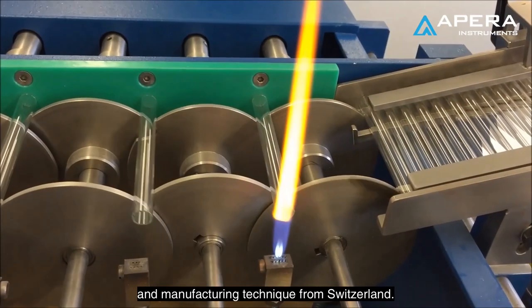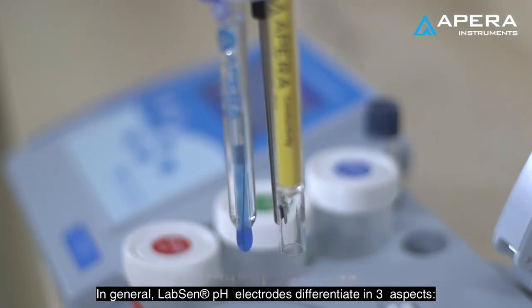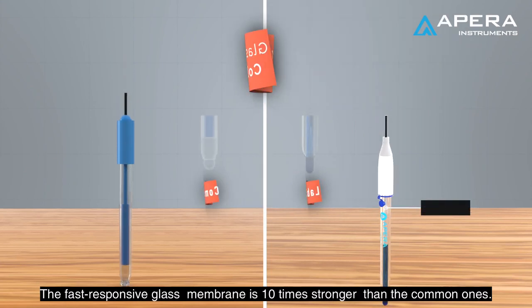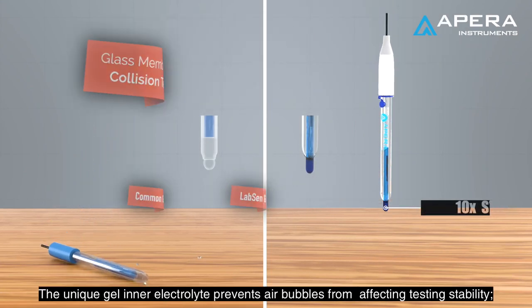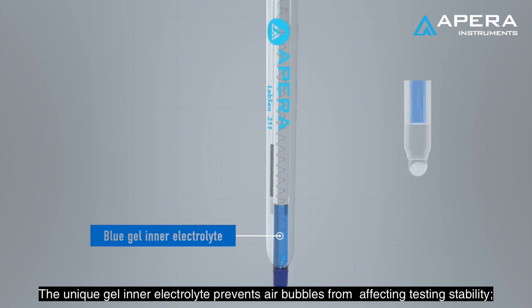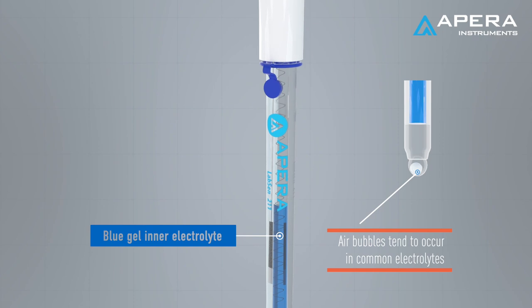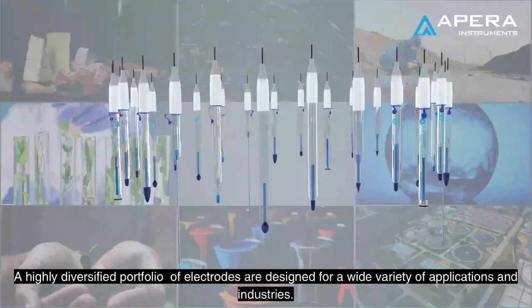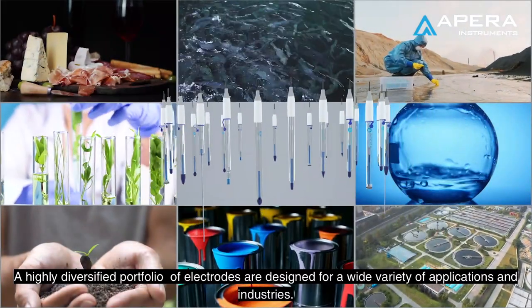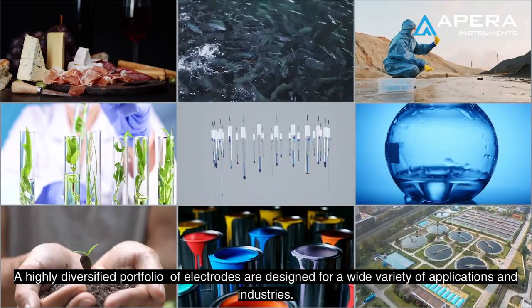In general, labs and pH electrodes differentiate in three aspects. The fast responsive glass membrane is 10 times stronger than common ones in the market. The unique gel electrolyte prevents air bubbles from affecting testing stability. A highly diversified portfolio of electrodes is designed for a wide variety of applications and industries.